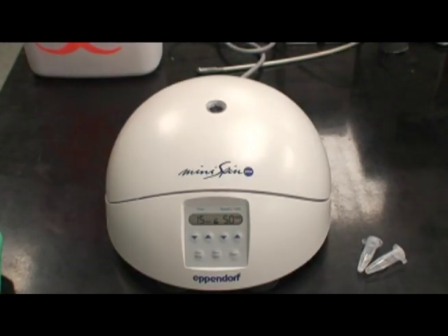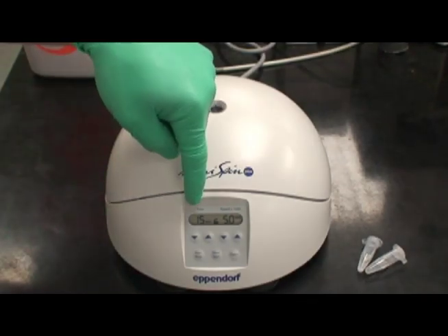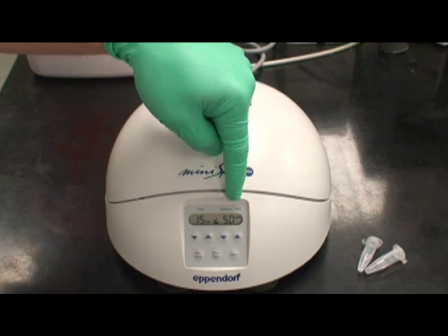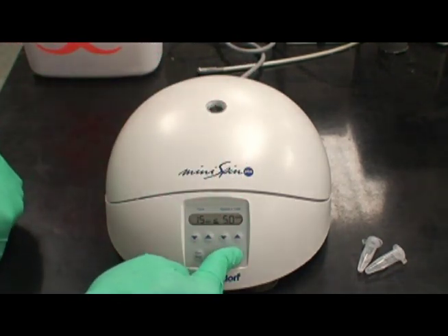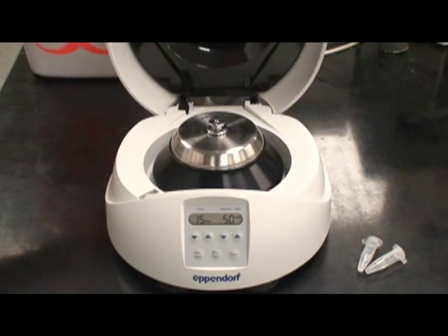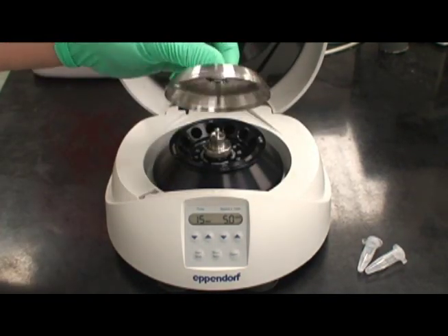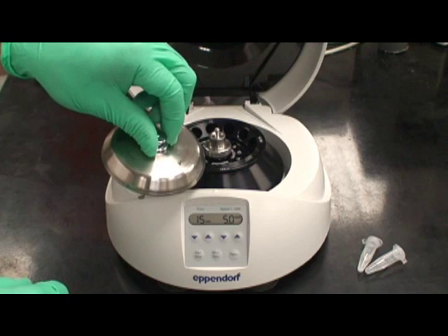This is an Eppendorf microfuge device. As you can see, the time and speed can be adjusted by arrows below. The lid can be opened by pressing the button as shown. The metal lid must be replaced prior to use to avoid damage to the device.